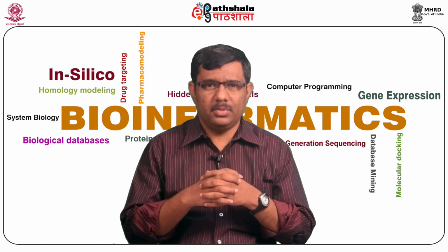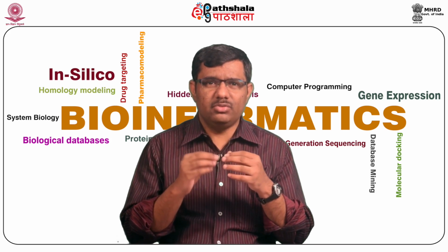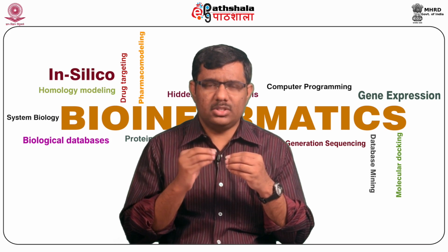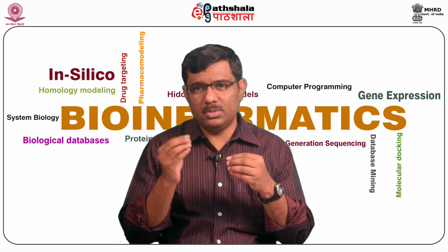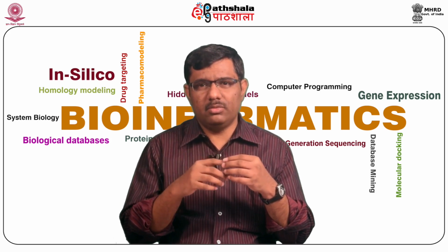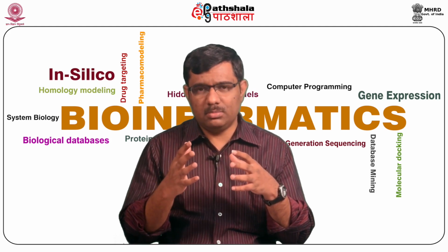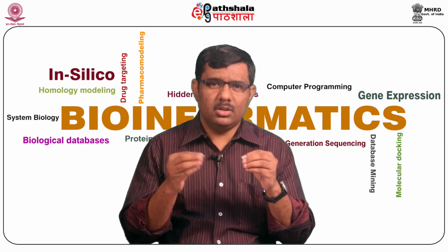of the protein. There are many errors which we need to check before we select a PDB structure as a template for structure prediction, such as technical errors, whether it is a crystal-specific error, or incomplete data during data collection, or an NMR-specific error where certain regions are not defined properly, or the fold assignment during structure prediction has not been done properly. These are the possible errors. Many more errors we'll discuss in this module.